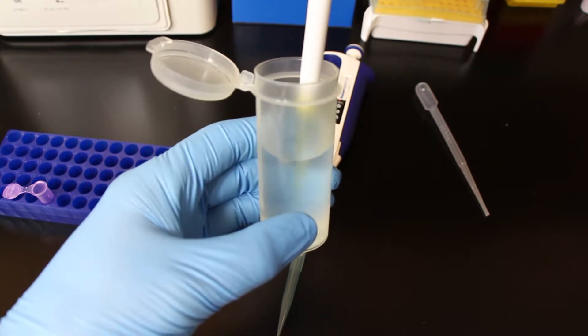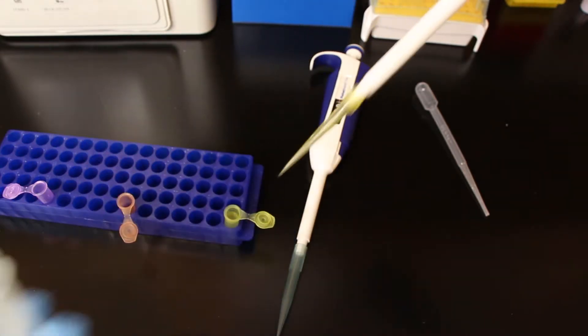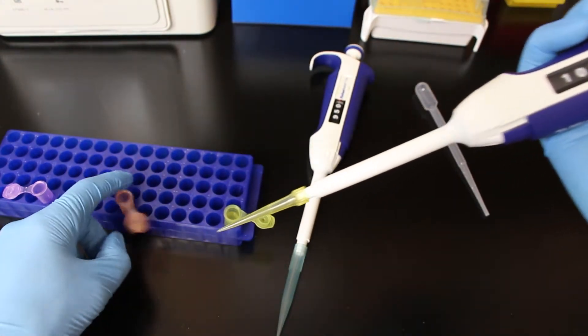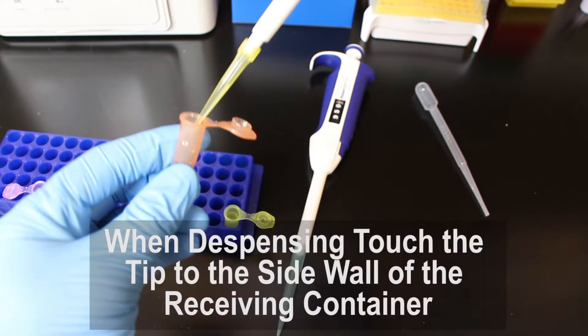You're going to push down to the first click, put it into the sample, and then let go of the button slowly, and it's going to suck up the solution. When you take that pipette out of the original solution and you put it into your new sample container, you then push to the second click — essentially what you're doing is putting a little air behind the liquid sample to make sure that all the liquid sample comes out.